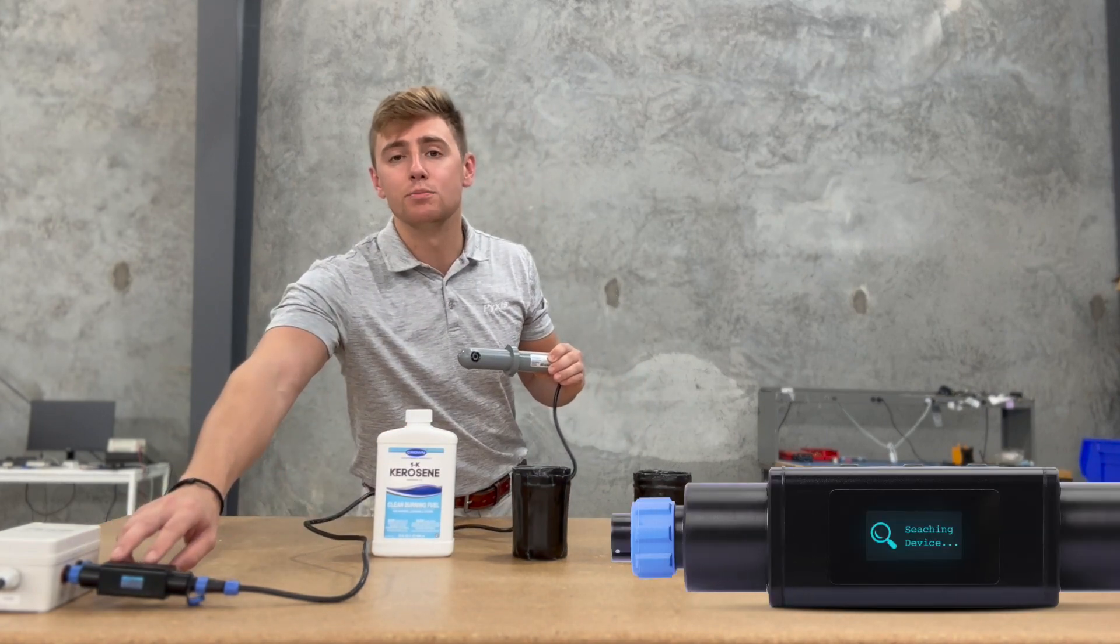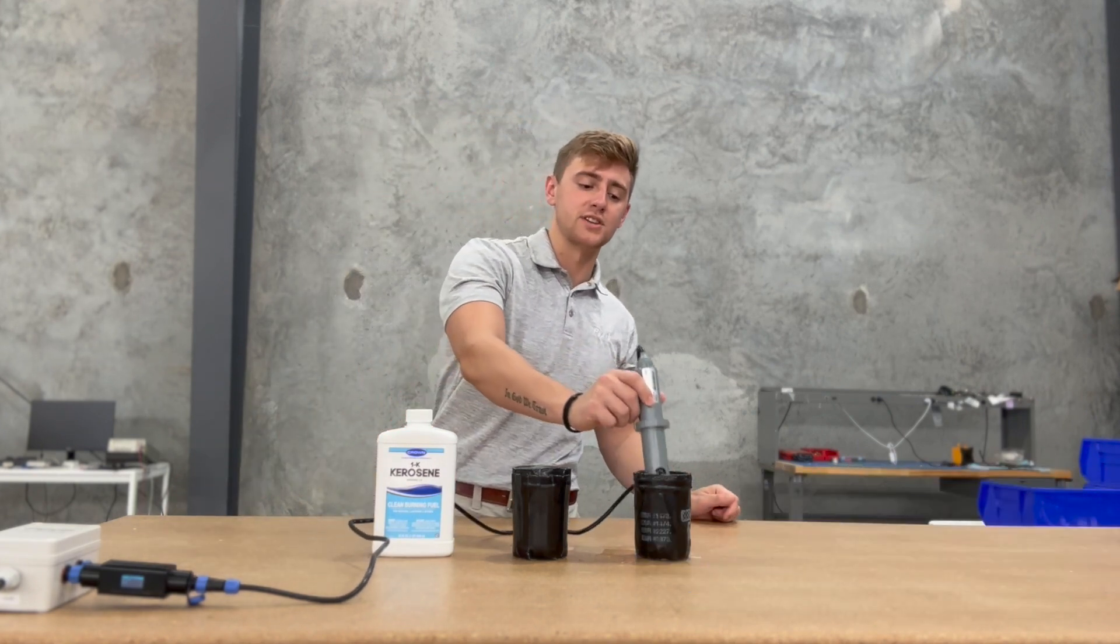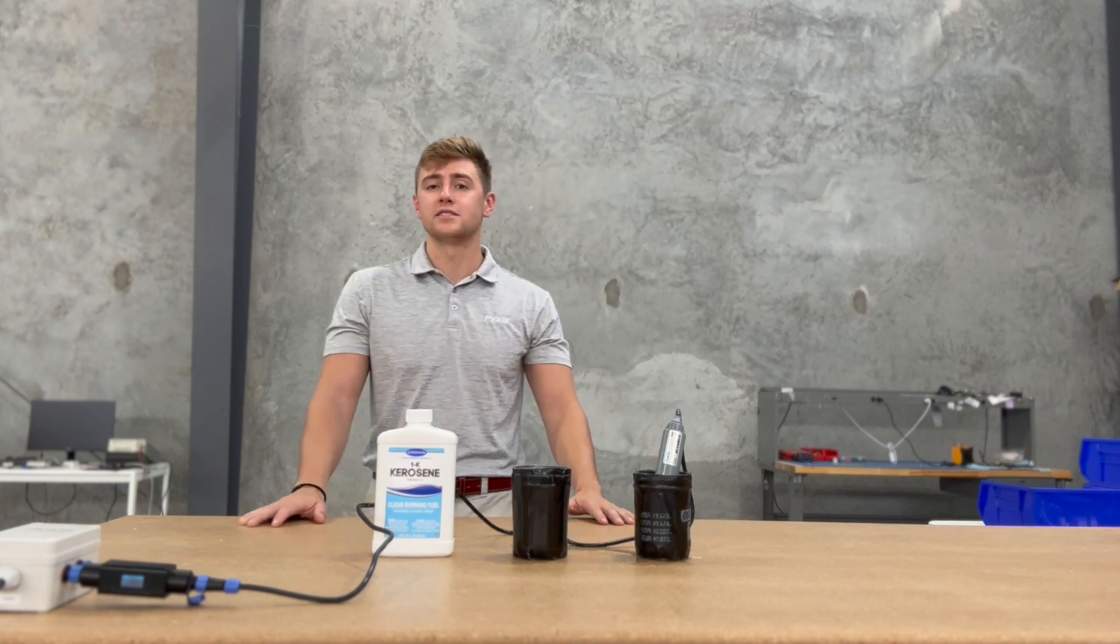So it connects to our MAWB Bluetooth adapter for wireless communication to Pixis and I wanted to set up a little scenario for you guys here to demonstrate the sensor, but to start I wanted to break down the series itself.